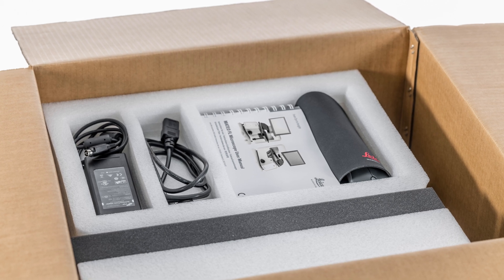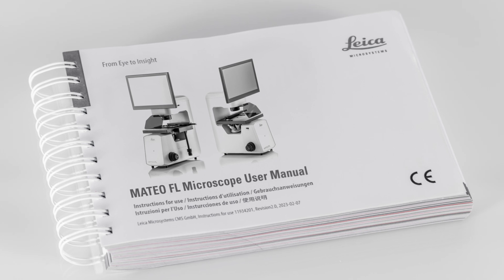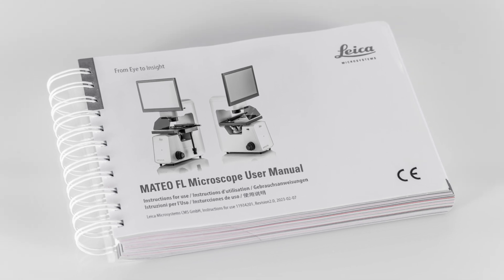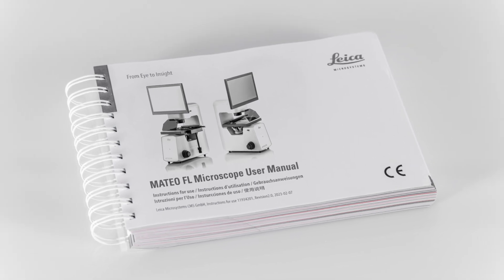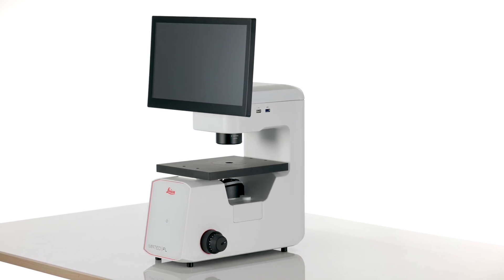The contents of the box may vary according to the components you purchased. The top tray contains the user manual and an inventory list. Underneath the top tray is the body of your Mateo FL Microscope.